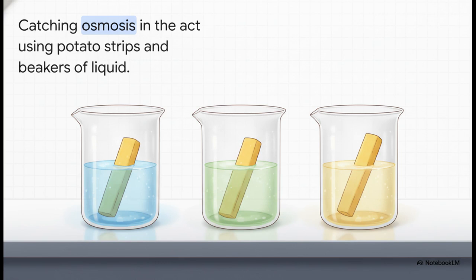All right, talking about invisible glowing molecules is great and all, but here in the lab, we demand evidence. So let's step back to the bench to actually prove this invisible theory. We're going to catch osmosis in the act, and we're going to do it using nothing more than carefully prepared strips of our ordinary potato and a few neatly arranged beakers of liquid.